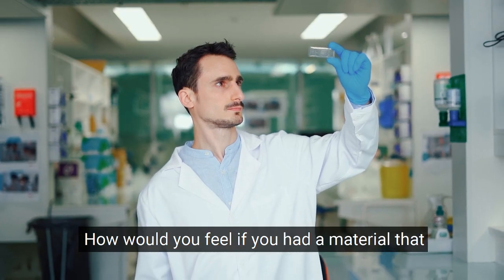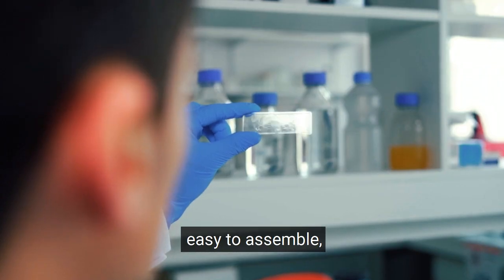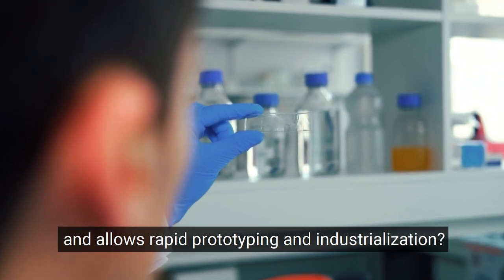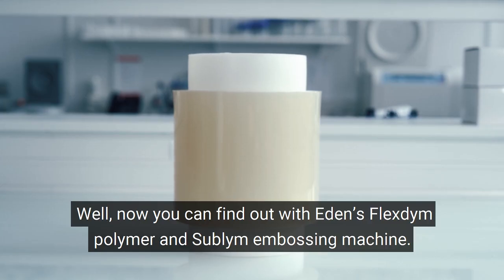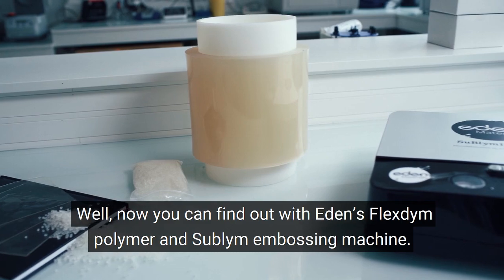How would you feel if you had a material that is biocompatible, easy to assemble and allows rapid prototyping and industrialization? Well, now you can find out with Eden's Flexdym polymer and Sublym embossing machine.